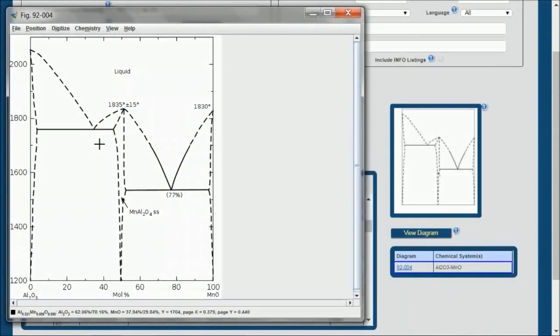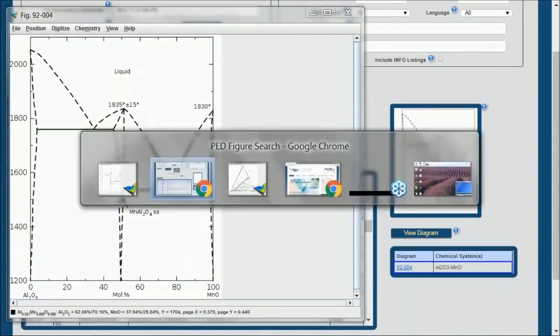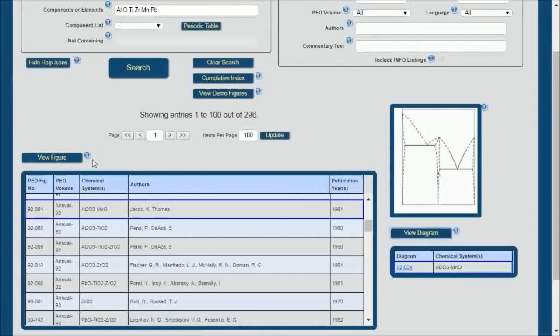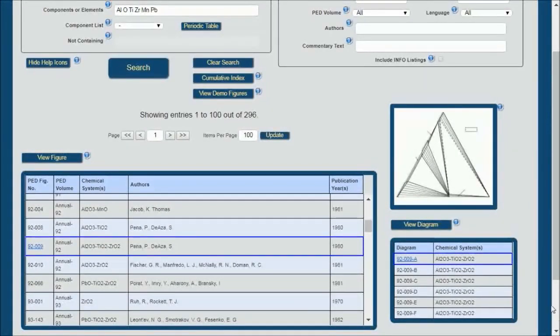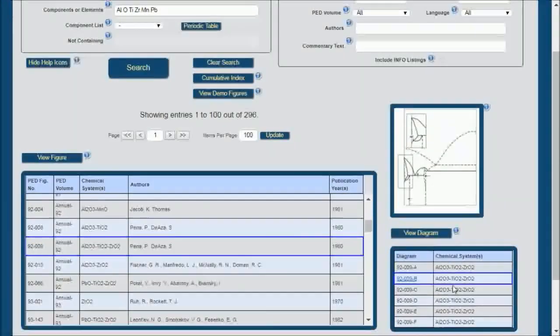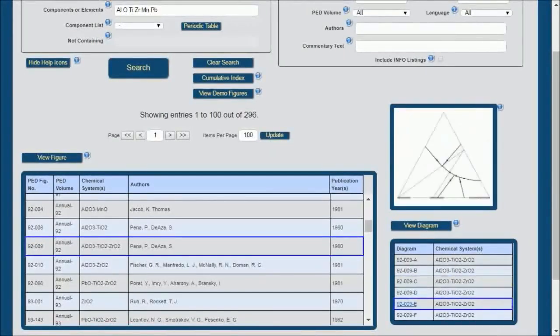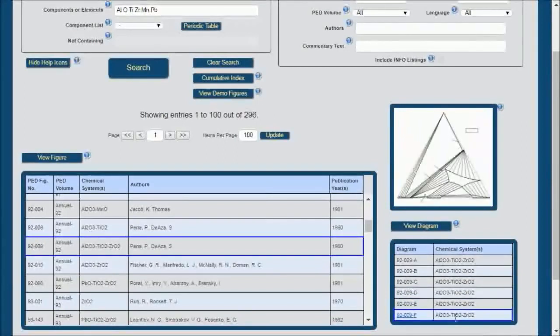Well, let's go on to our next example. When I move to the alumina, titania, zirconia system, you'll notice we don't have one phase diagram but we actually have six. And as I move through these six, you'll notice how the figure in the window changes. So you can see how that is quite useful.